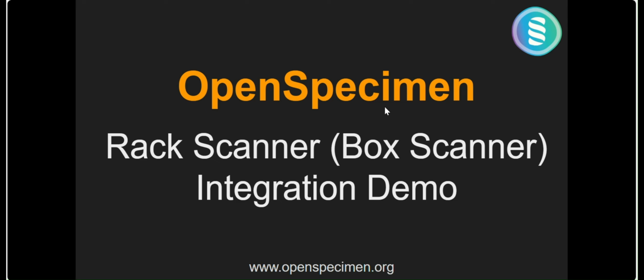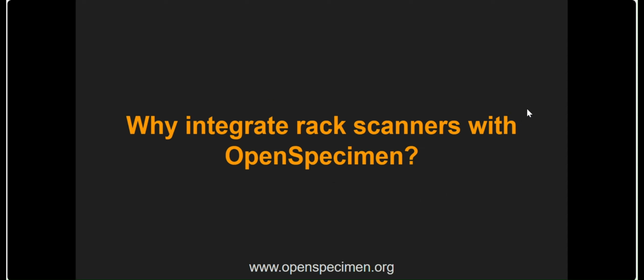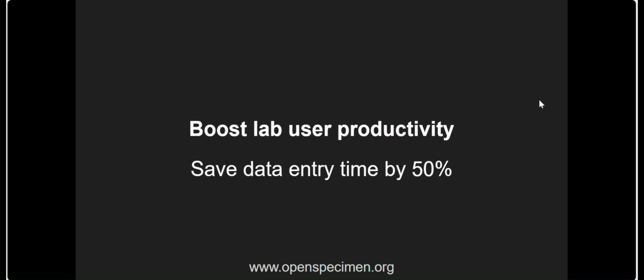Hello everyone. Today we will be seeing a demonstration of how OpenSpecimen can integrate with rack scanners or box scanners. The first obvious question is why integrate rack scanners with OpenSpecimen? And the answer is simple. It is known to boost lab user productivity.